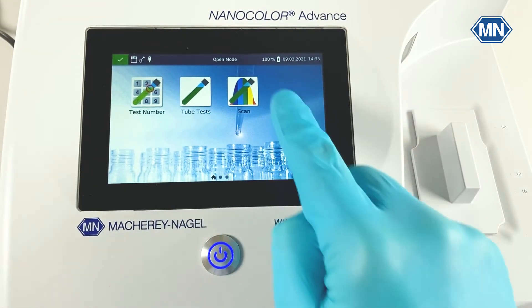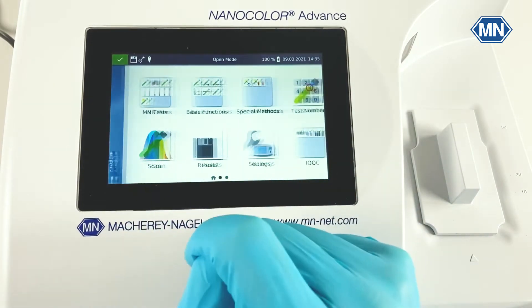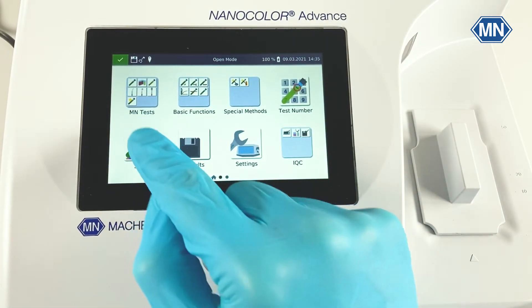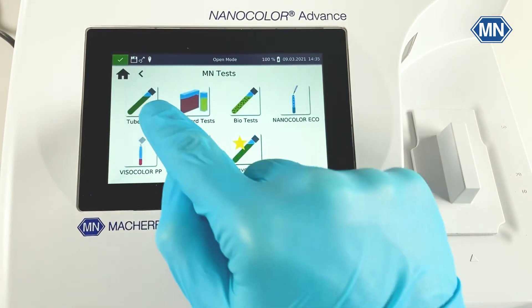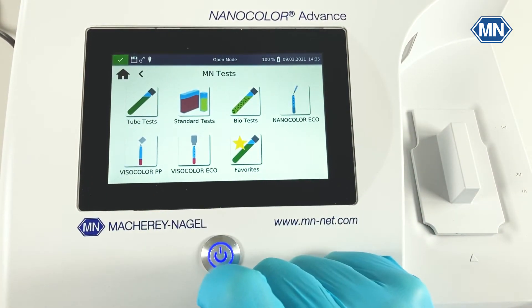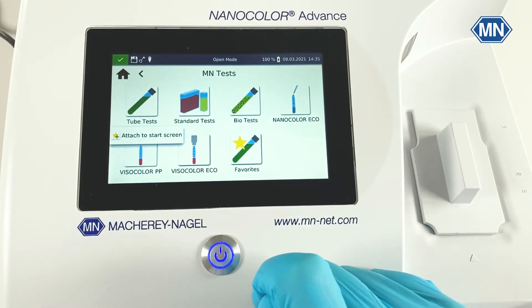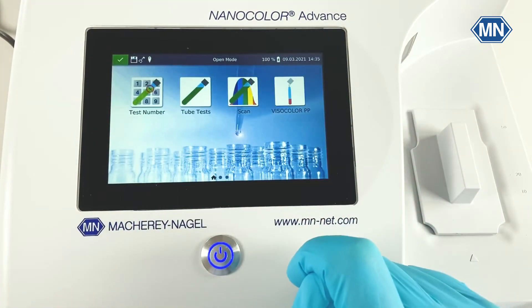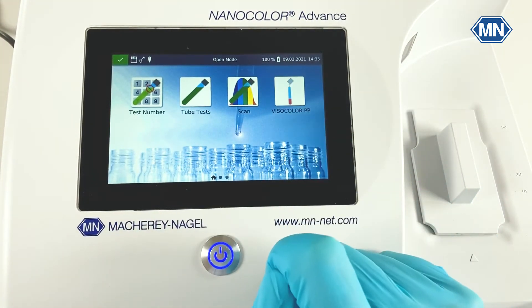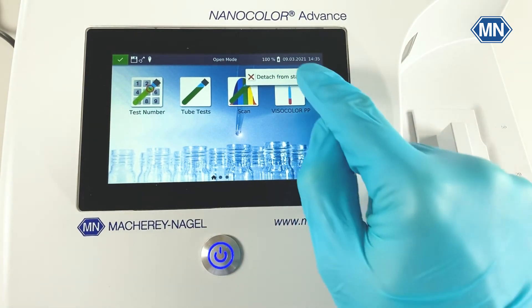The first page contains the favorite items, which you can customize as you will see in a moment. The second page contains the most important photometer functions like the measurement of nanocolor tube tests or visocolor powder pillows. From here, you can also favorite an item — just hold it for a few seconds and attach it to the start screen. As you can see, it pops up right here. If you don't need it anymore, just hold it again for a few seconds and detach it.